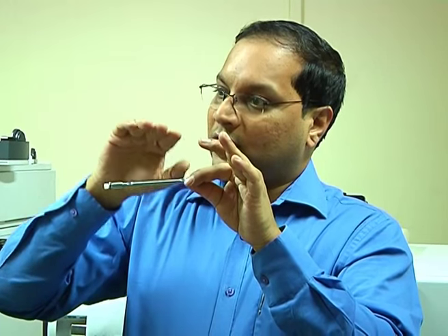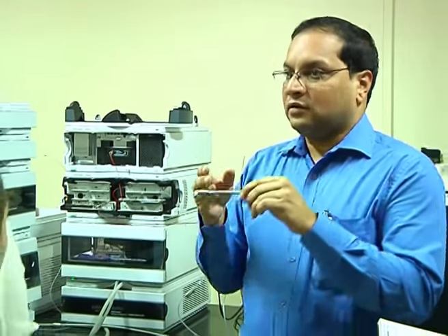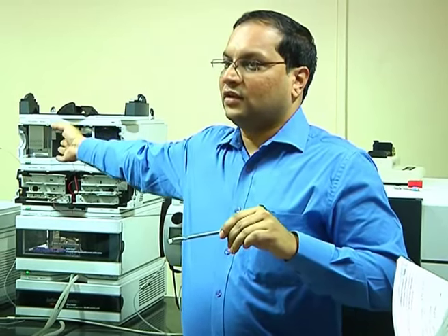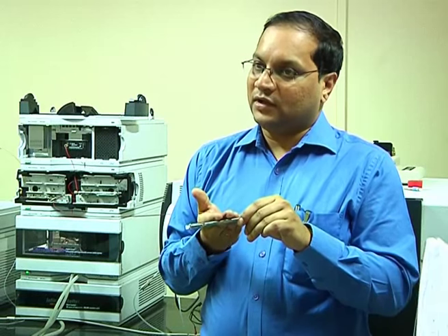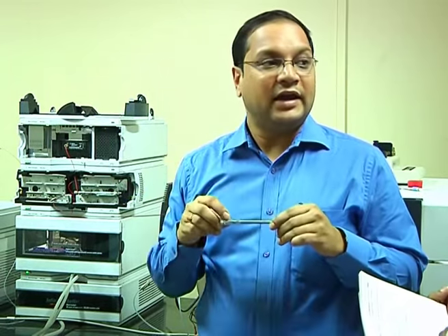You increase the organic content slowly and reduce the aqueous content, so that the polarity is changing, and depending upon their binding capacities, they will cleave off from this and then start eluting. Yes. If this is so, it means I can measure the peptides in UV itself. Why do we need MS? It is retaining everything, and eluting also, and you can measure it in UV also. Then why do we need the MS?